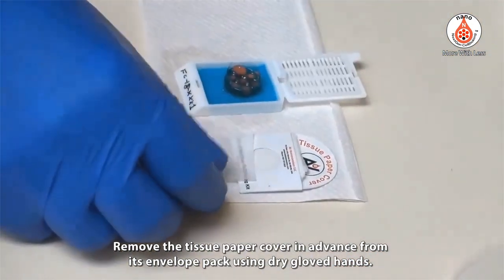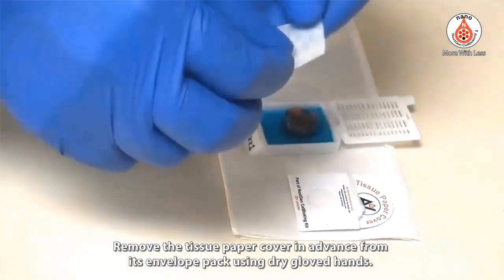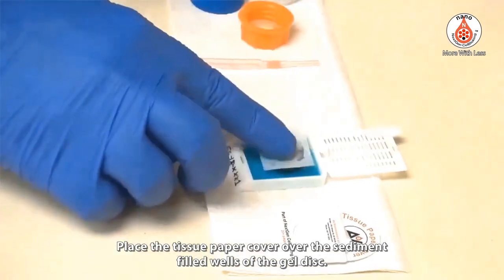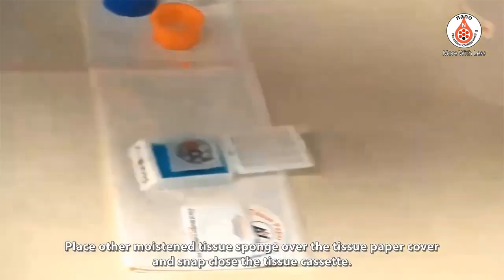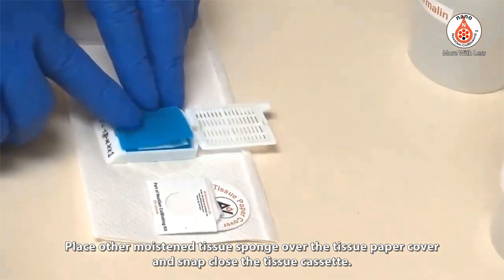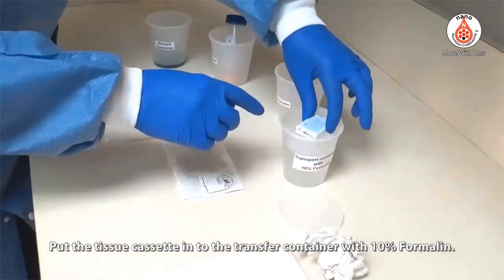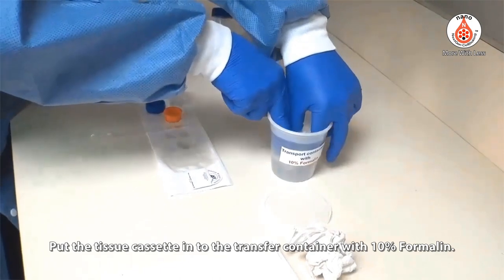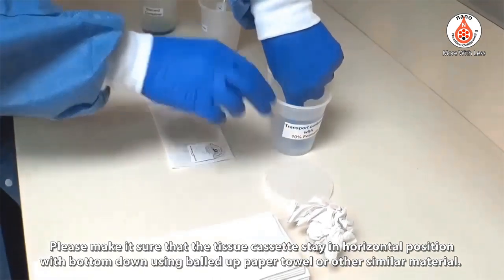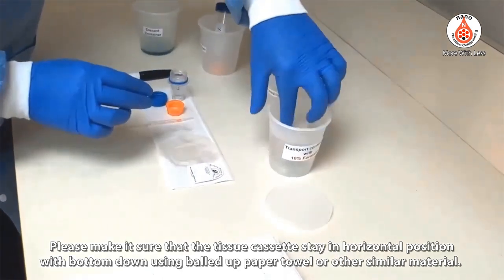Remove the tissue paper cover in advance from its envelope pack using dry gloved hands. Place the tissue paper cover over the sediment-filled wells of the gel disc. Place the other moistened tissue sponge over the tissue paper cover and snap the tissue cassette closed. Put the tissue cassette into the transfer container with 10% formalin, ensuring the cassette remains in a horizontal position with the bottom facing down — use a balled-up paper towel or similar material to secure its position.